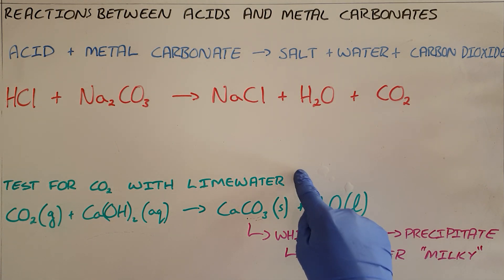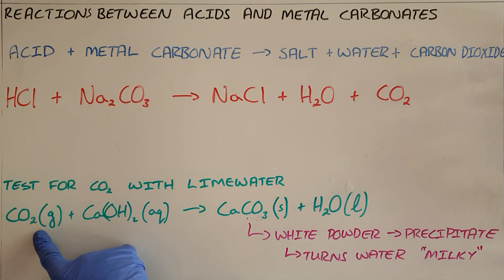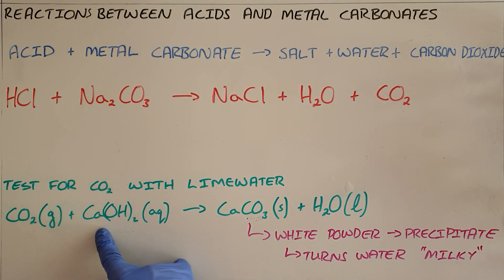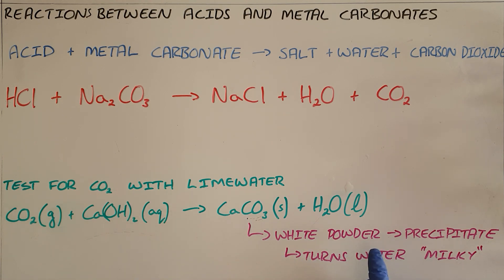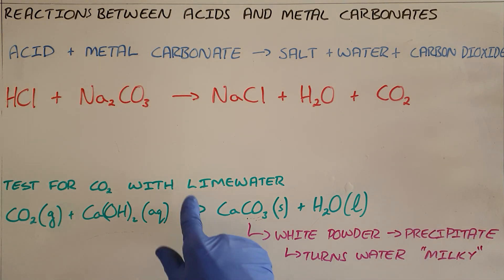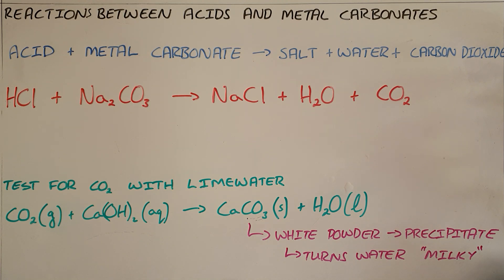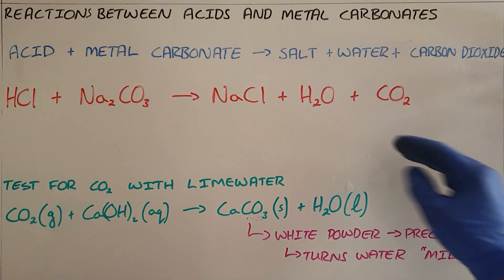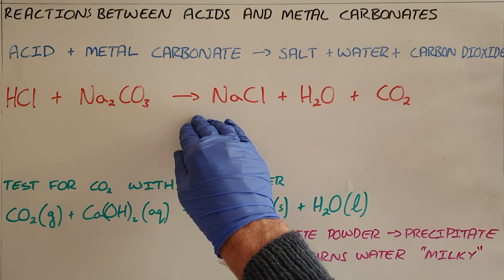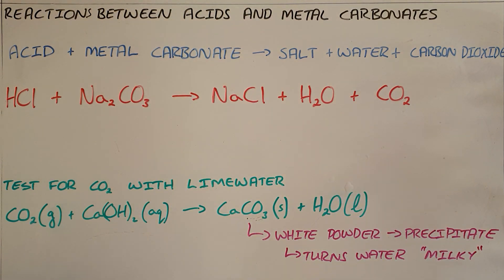The lime water test for carbon dioxide works because lime water, when it reacts with carbon dioxide, forms the following reaction: carbon dioxide combines with calcium hydroxide to form calcium carbonate, which is a white powder. This forms a precipitate in the solution that makes the clear lime water turn milky, and that is how we know that carbon dioxide is present. We are going to simultaneously perform the acid plus metal carbonate reaction and test that it produces carbon dioxide with the lime water test.